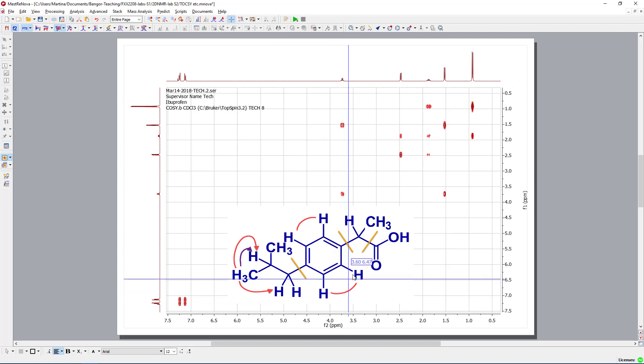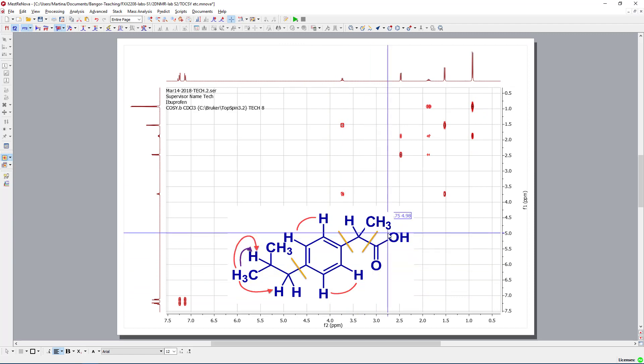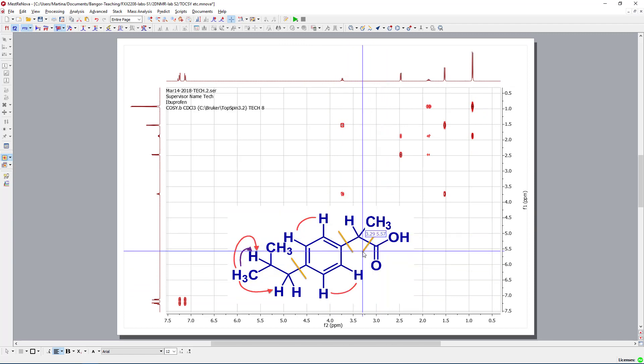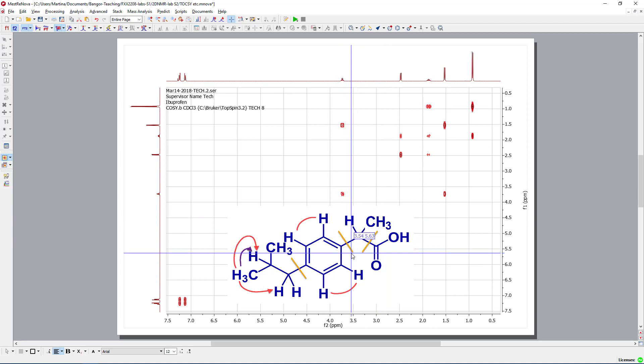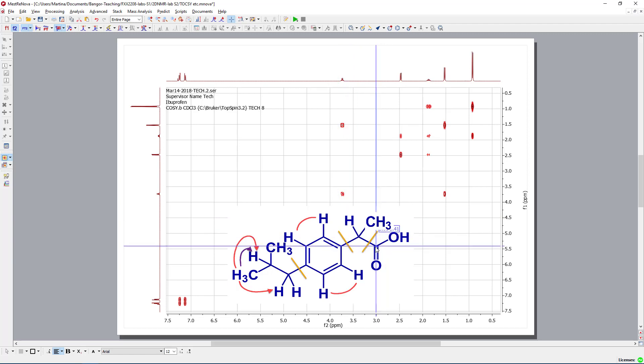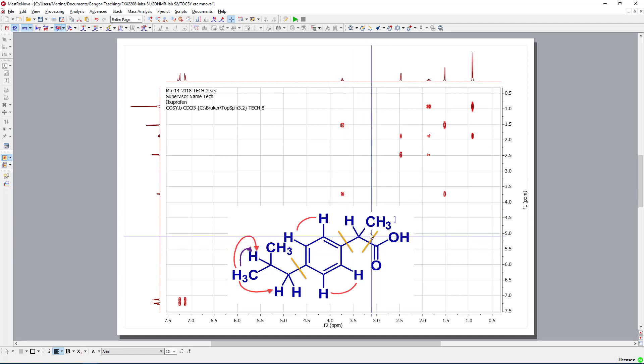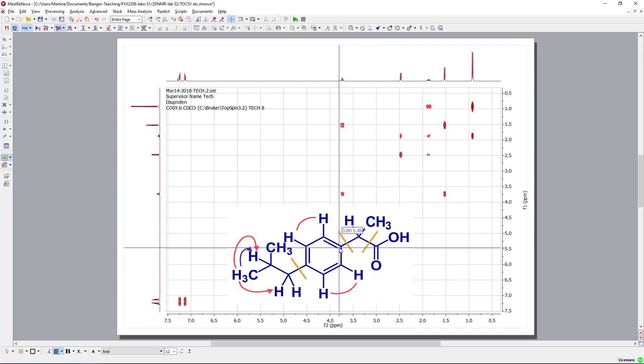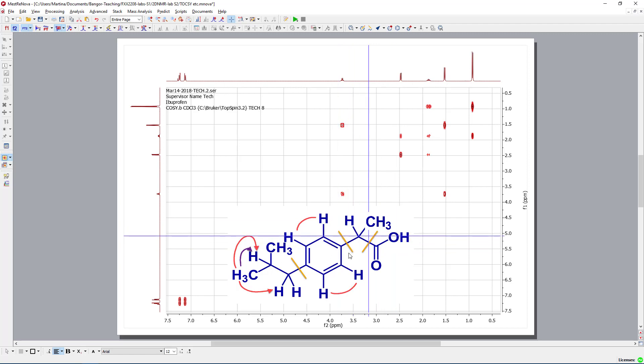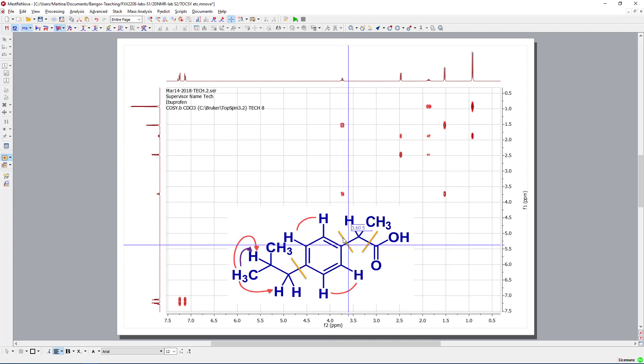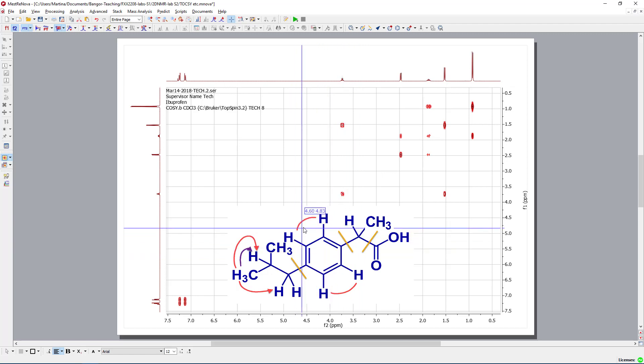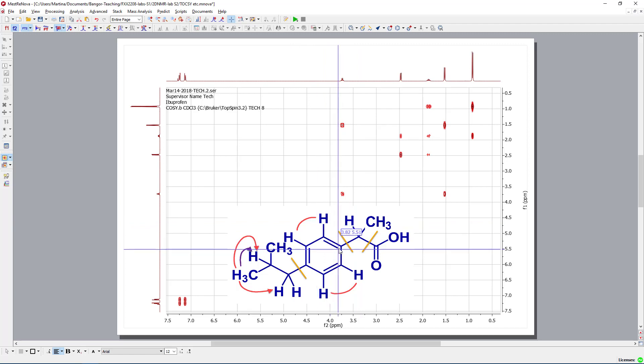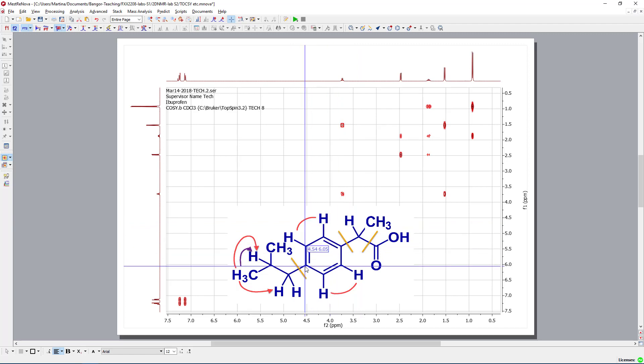I said there wouldn't be many differences, because if we look here, this CH2 group is completely locked off. So, here is a carbonyl group, so here we have no chance to see anything over there. Here we have a quaternary carbon, so this one won't form any difference in a TOCSY. Here we would see the standard coupling we also see in the COSY. We would not be able to see over those quaternary carbon atoms.